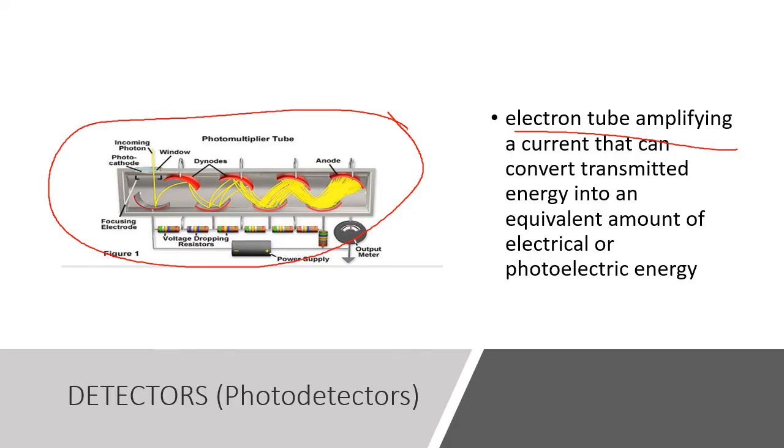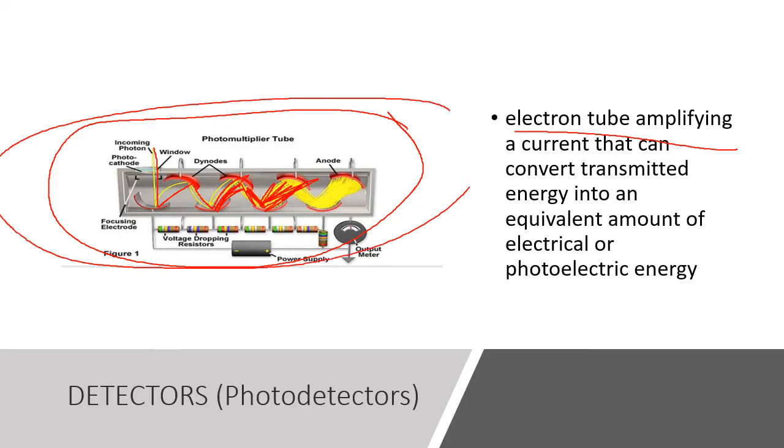No, so at first glance, it's going to look like it's amplifying your wavelength. No? So after the light exits the cuvette or dumaan na siya sa cuvette, it's going to be a very minute amount of light. Sobrang liit niya. So the job of our photomultiplier tube, as this is to amplify that light so that madedetect natin siya.